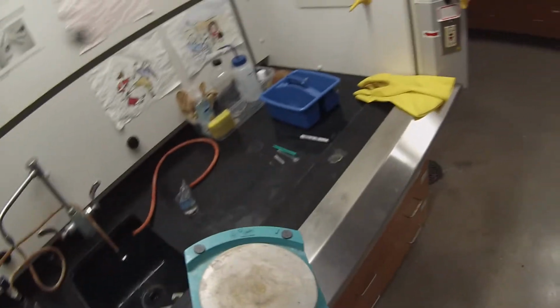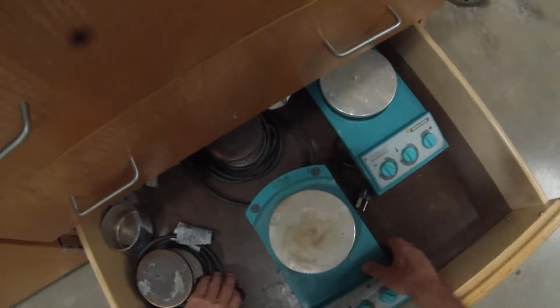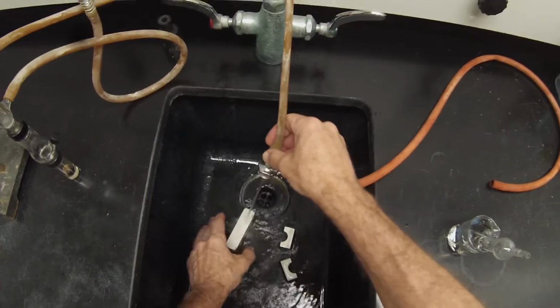Obviously I want to make sure the cord doesn't come in contact with the hot plate, so once again I'm going to roll that cord up so the cord is underneath the stirring hot plate when I put it away, and there's no risk of meltable rubber coming into contact with hot plate. So that'll sit right there. No one's going to touch it. And I'm just going to run cold water on those guys to cool them down fast so I can put them away.